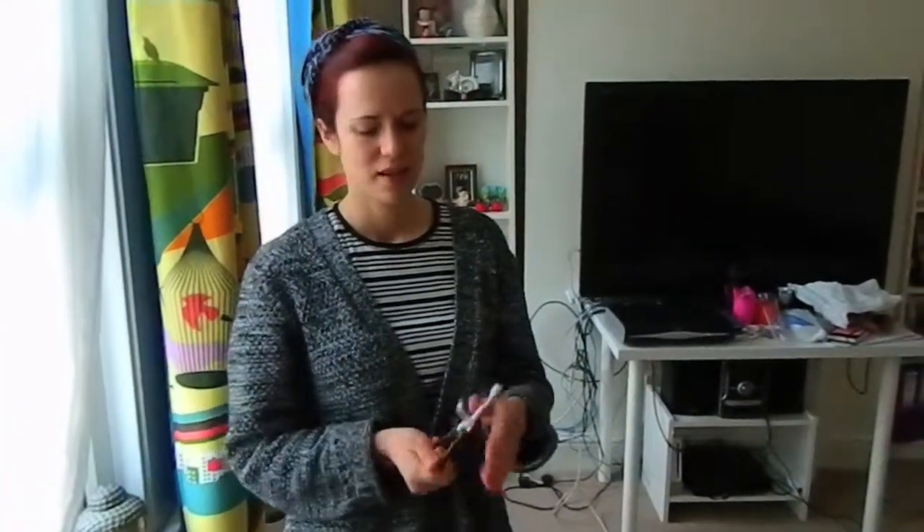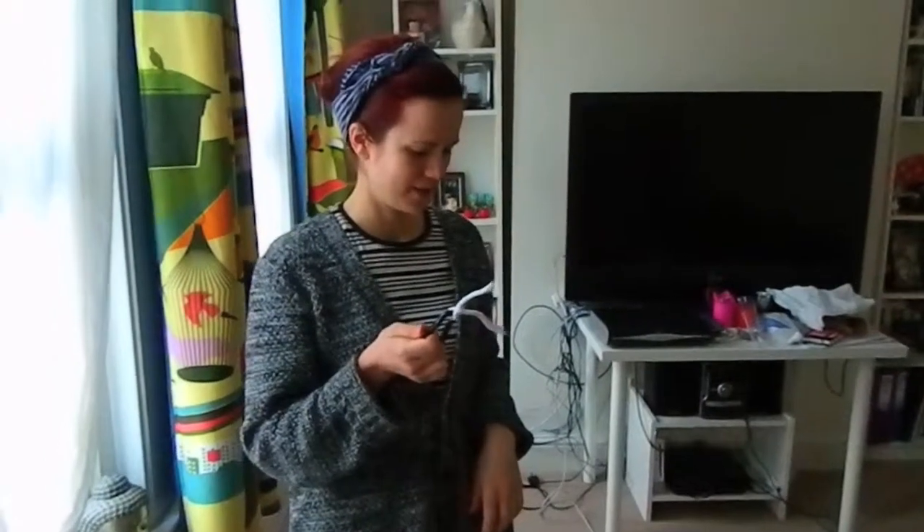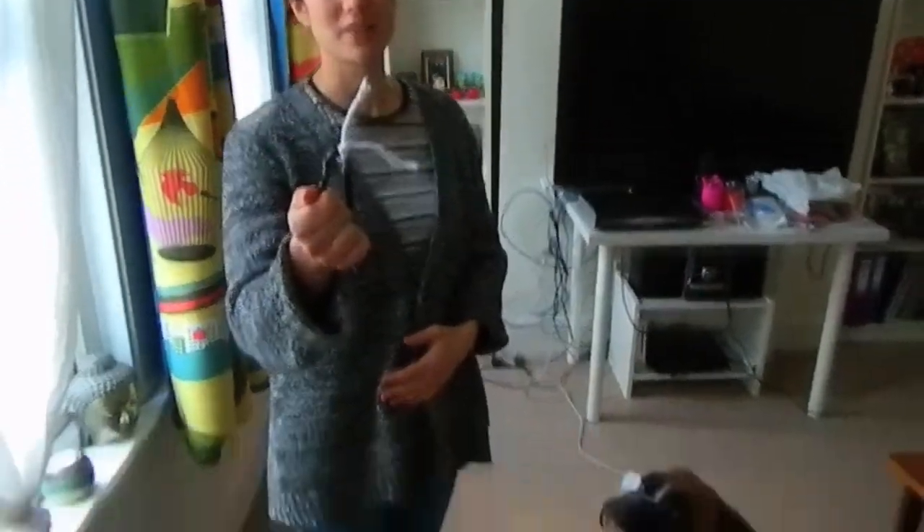Before you start to take the sample, make sure you have washed your hands. Then tie the little cotton rope to the carabiner hook — a double knot is good — and hold on to this part while you're taking the sample.